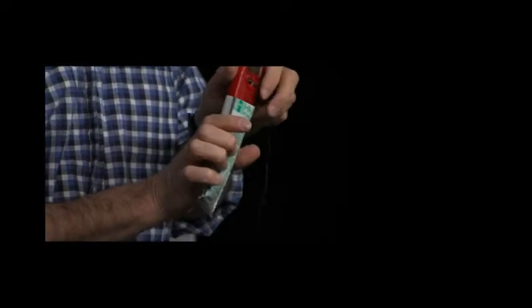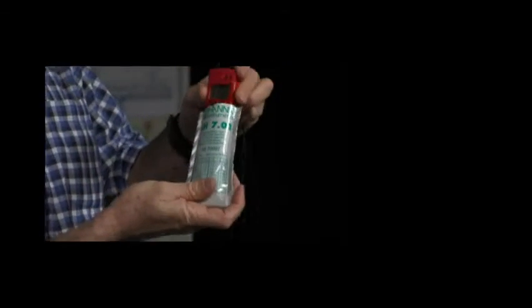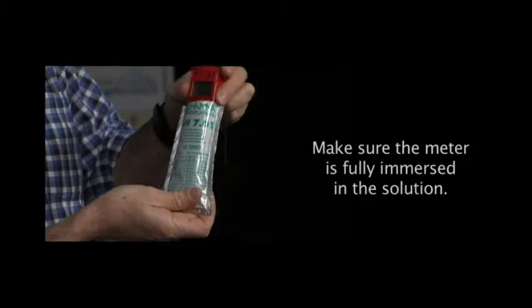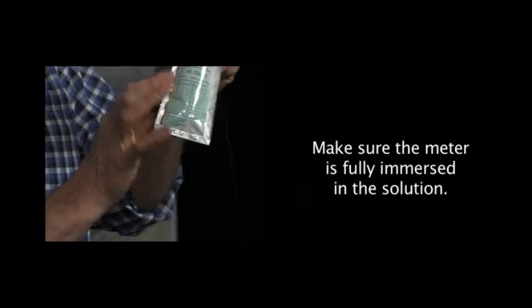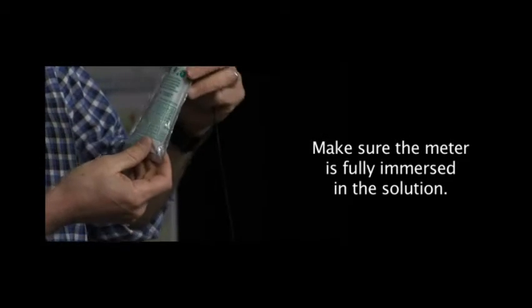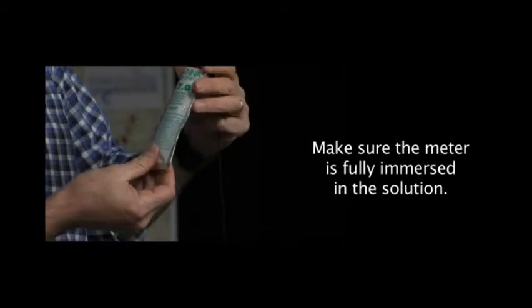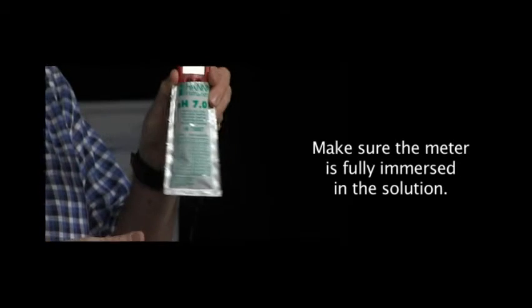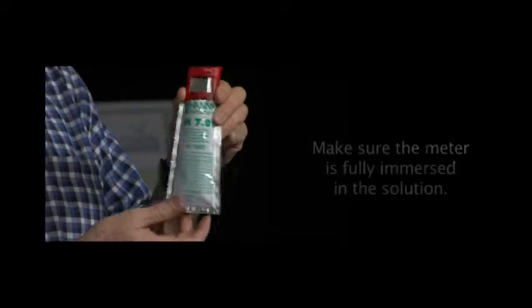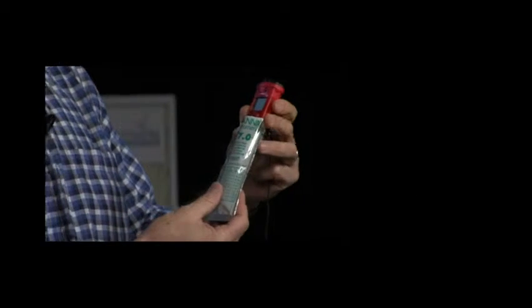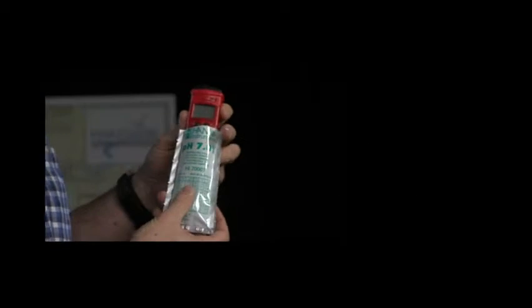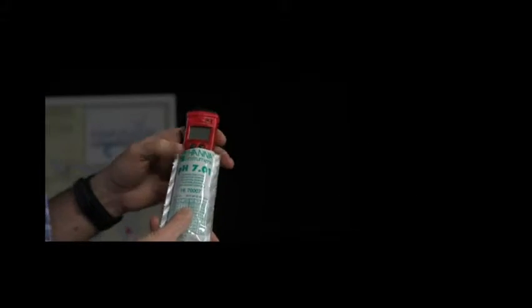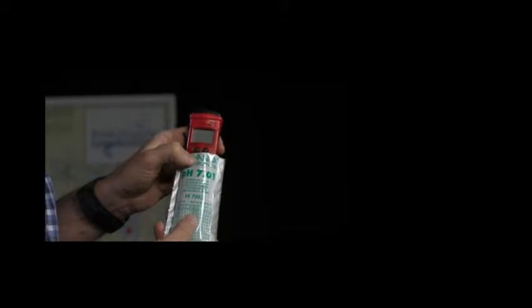We'll put the meter down in the packet. There's a little bit of fluid in there that is a known pH of 7.01. Shake it around a little bit. We're going to turn the meter on by pushing the left button.